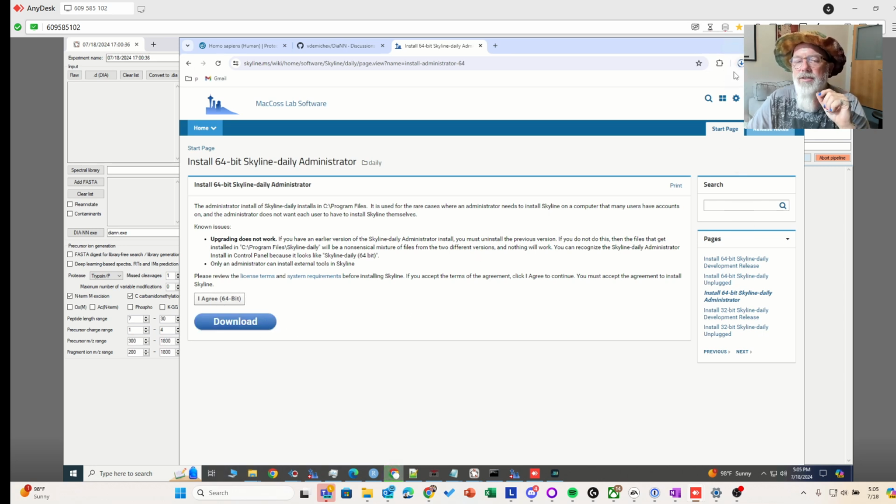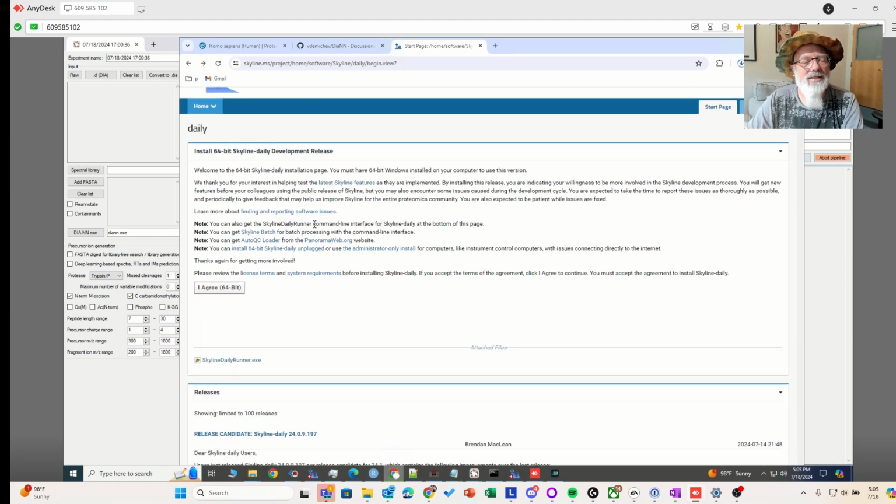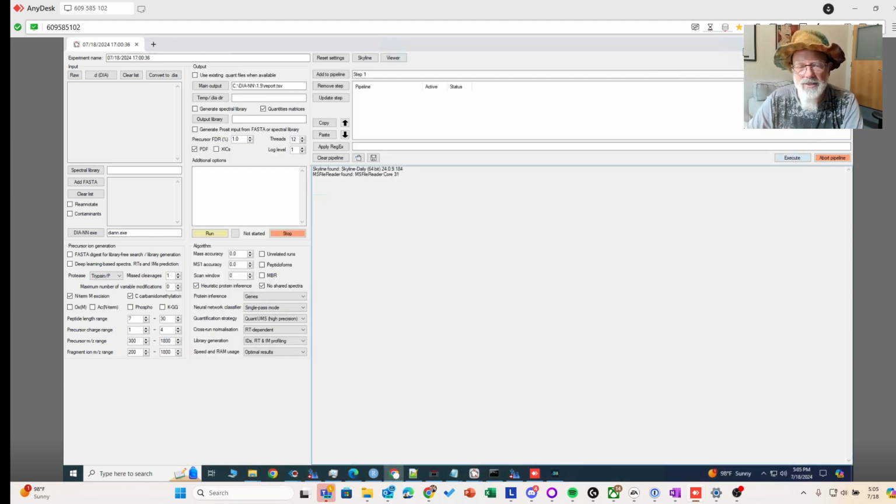You will have to install this as an administrator, I think. That threw me for a couple of days until I figured it out. And you know it works because when you open DIA-NN, it'll tell you Skyline Daily found. If it doesn't tell you that, I don't think it'll work.